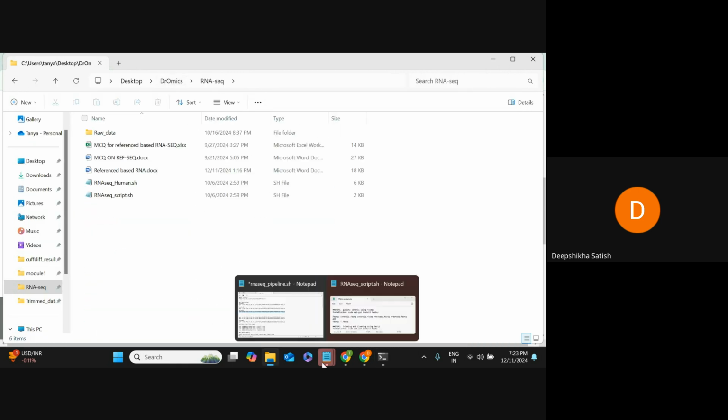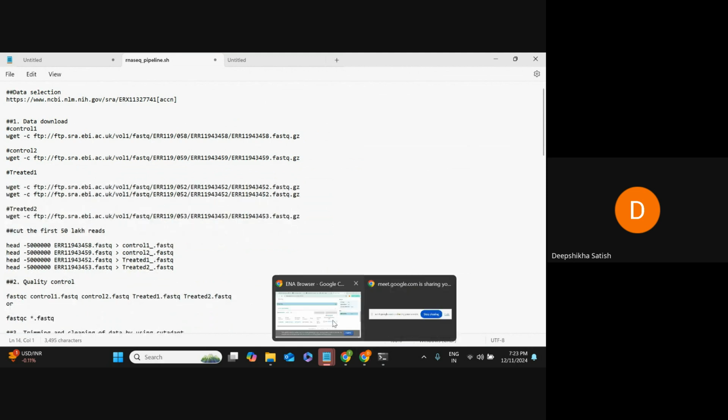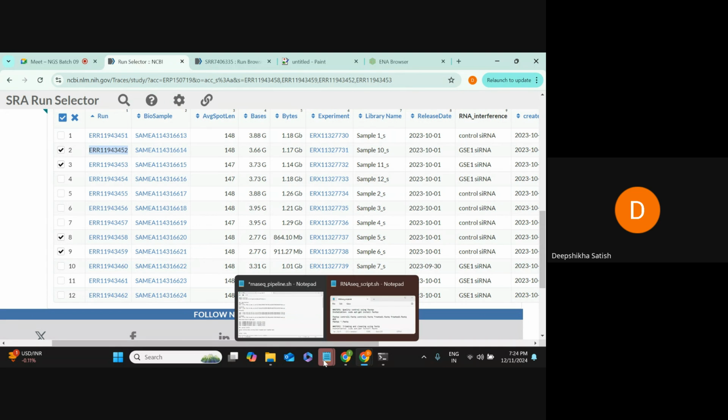Hello. All the commands. Ma'am, so I have to do all this in Anaconda? No, don't perform these commands, guys, because I've already shared the zip file with you. If you see here, the data is very huge. Can you see the size of this? Yes. Right.